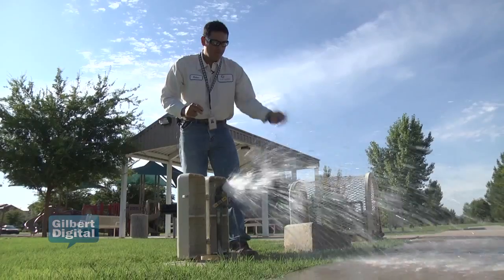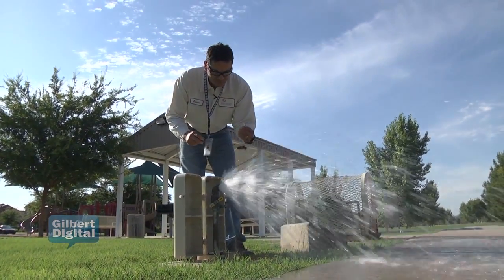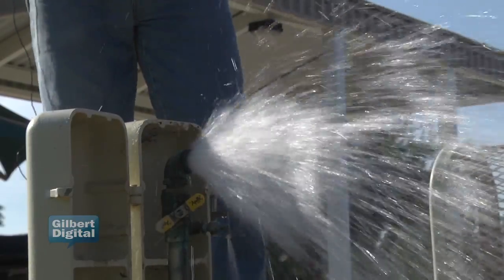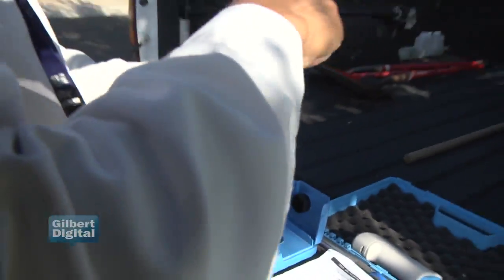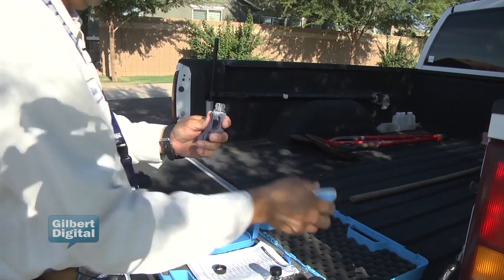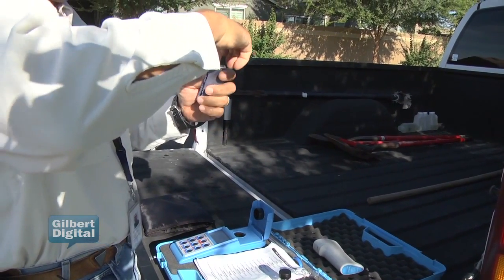Normally we flush between three to five minutes to get a good representative sample from our mainline and our source. We monitor our chlorine residuals — the chlorine levels on our mainlines — to check bacterial activity so we can control that.